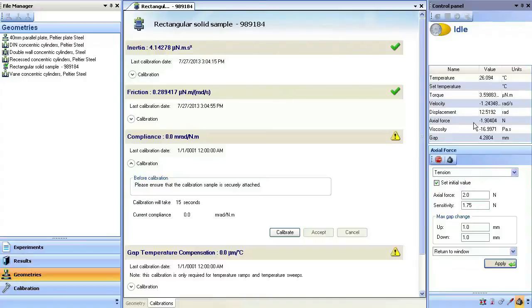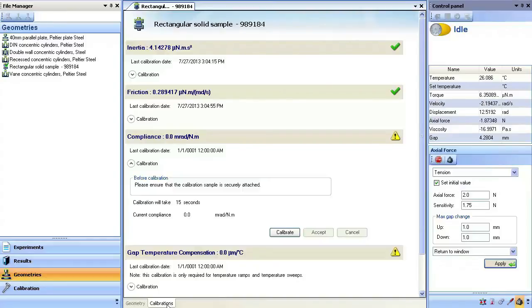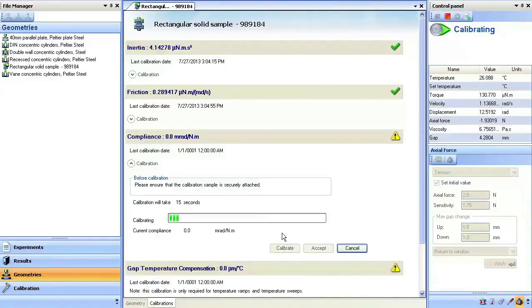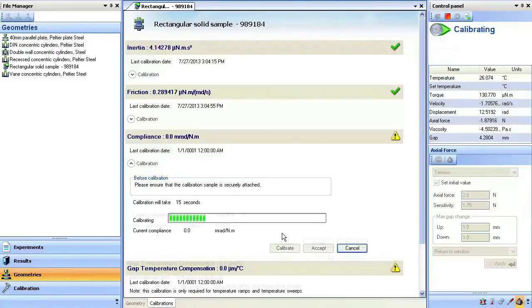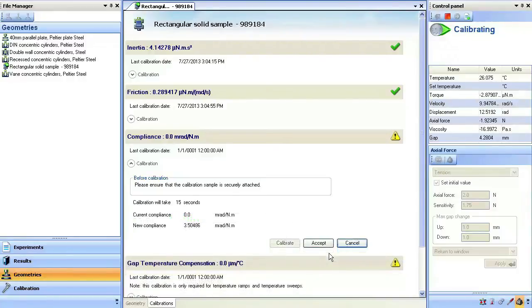Now go back to the compliance calibration window and notice that the sample is being held with an axial force. Press calibrate to initiate the calibration. Press accept when the calibration is completed.